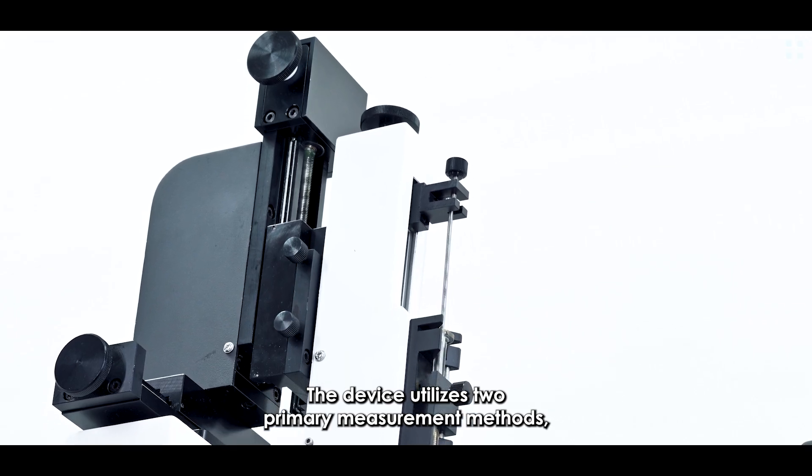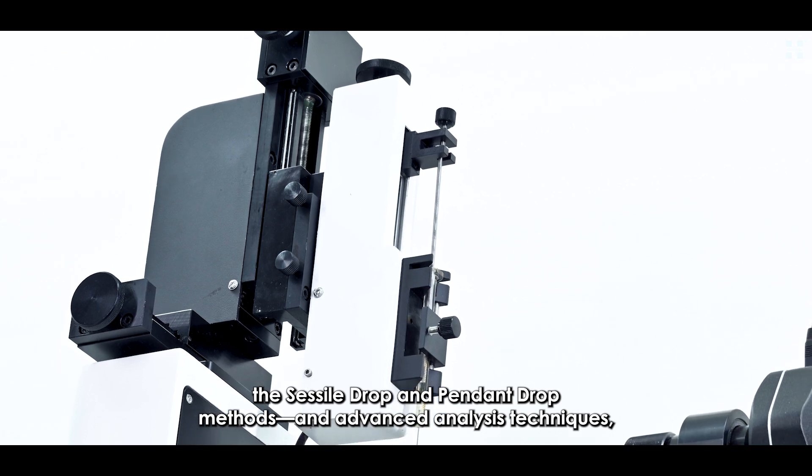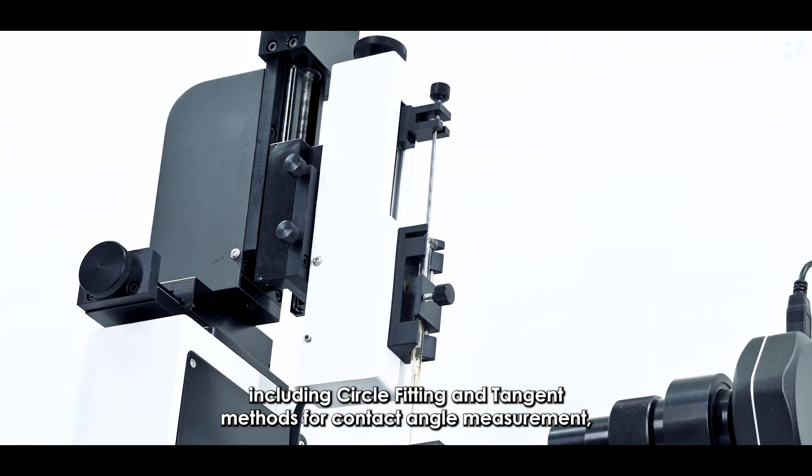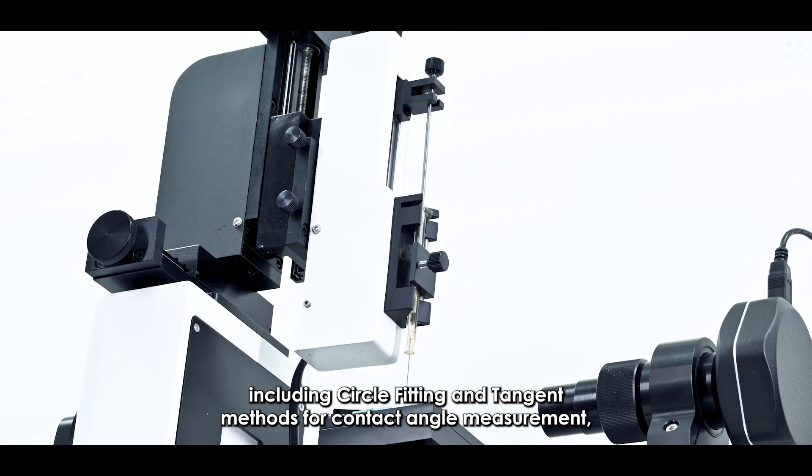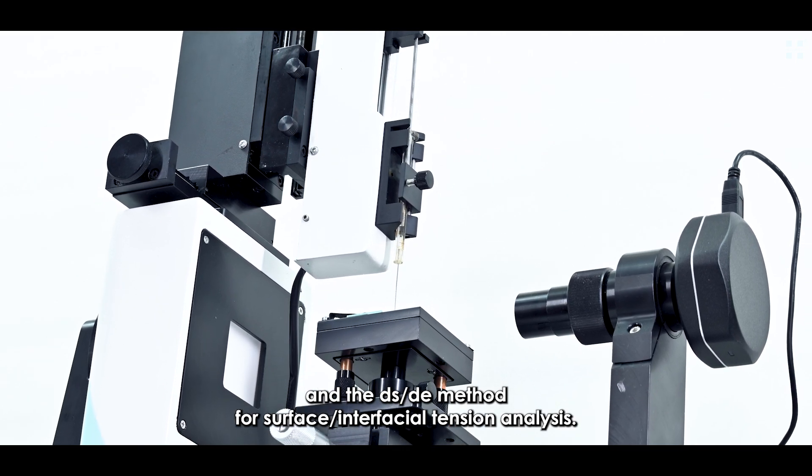The device utilizes two primary measurement methods, the sessile drop and pendant drop methods, and advanced analysis techniques, including circle fitting and tangent methods for contact angle measurement, and the DS by DE method for surface or interfacial tension analysis.